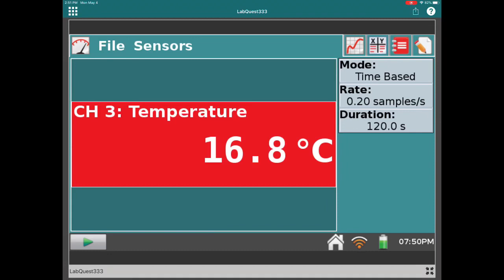Ethanol is the alcohol found in alcoholic beverages. As described earlier, we've got the beaker full of ethanol, and the thermometer sensor is in it with a piece of filter paper wrapped around the tip. The filter paper is soaking in the alcohol, and the thermometer is displaying the temperature of the alcohol. Let's press the collect button and begin recording temperatures.